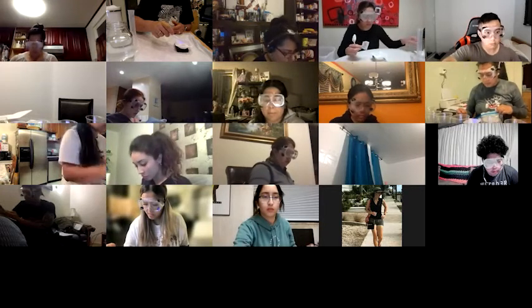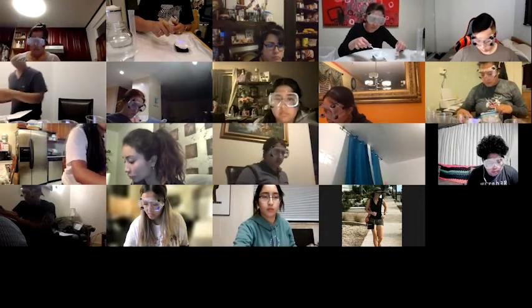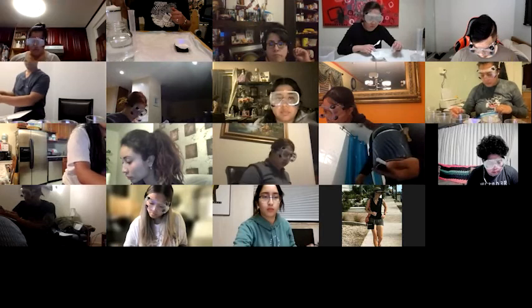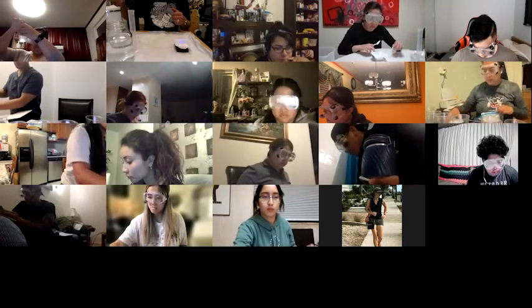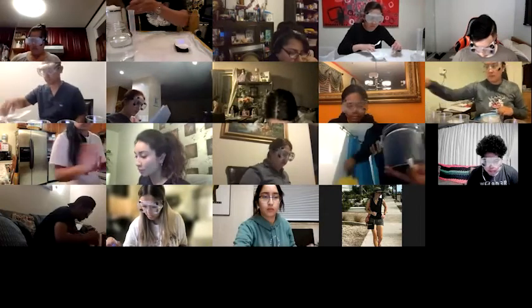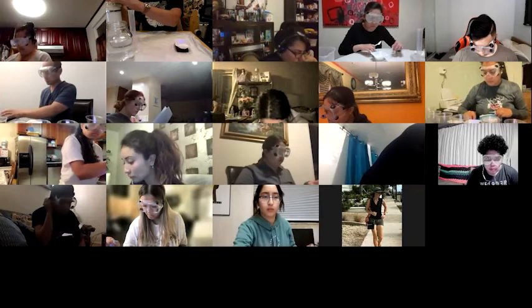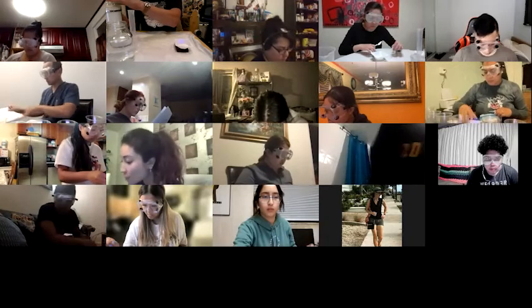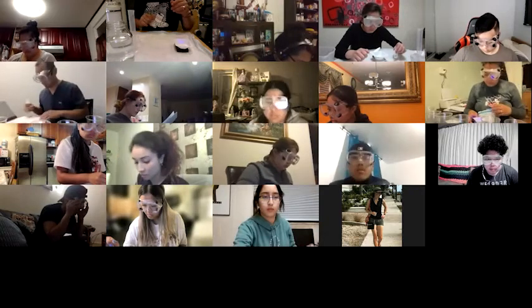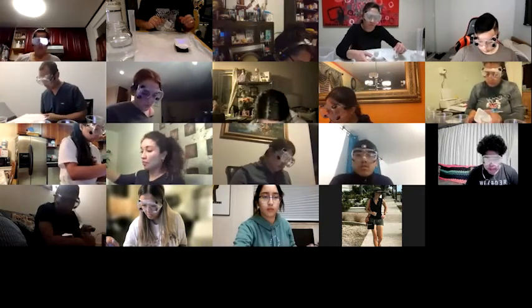If I go a little bit over or a little bit under the mass on some of these, that's no biggie. If I make the same mistake in the mass over and over and over, that compromises my experiment. If you go a little bit over on one mass and a little bit under on the other one, that's totally fine. Those little errors tend to work themselves out. So I got exactly 12.50 grams.